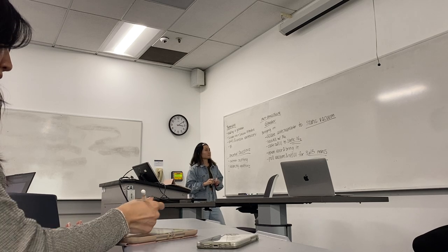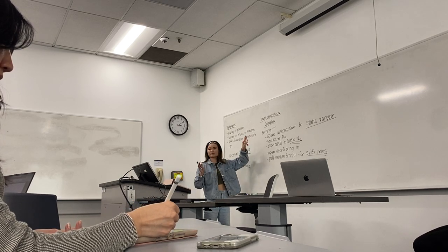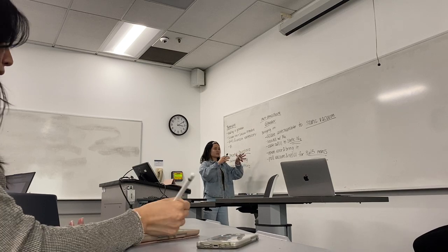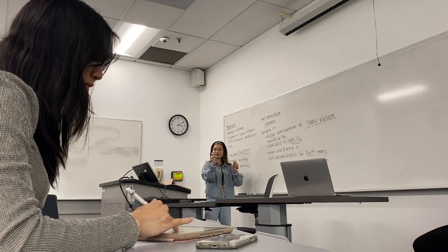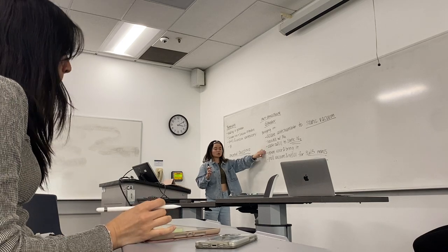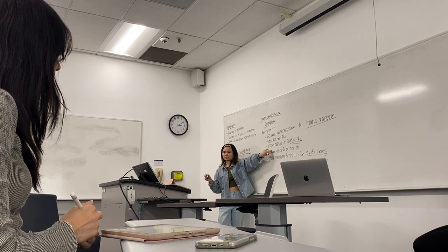So the main points for bringing things in, do people know what I mean when I say bring things in? Imagine opening the door, putting your glassware in. Your antechamber is always under active vacuum, so you want to make sure it's under static vacuum because you never want the vacuum and nitrogen open at the same time. Backfill with nitrogen, you close it to static nitrogen. Why do we close it to static nitrogen?